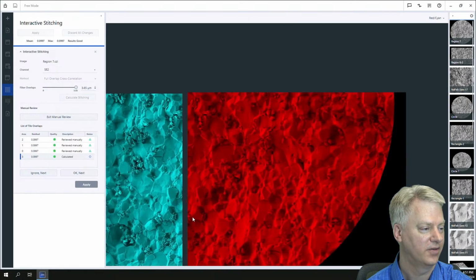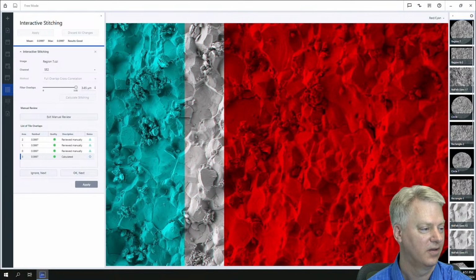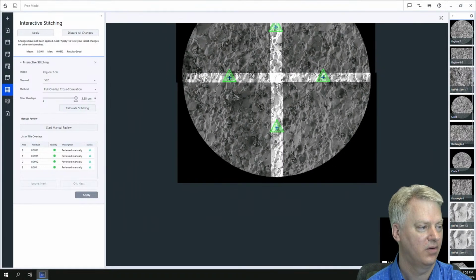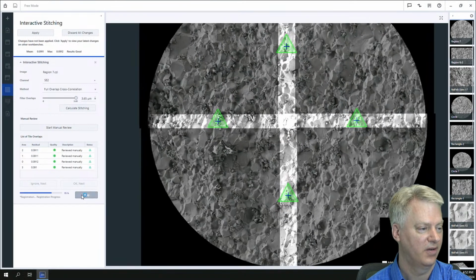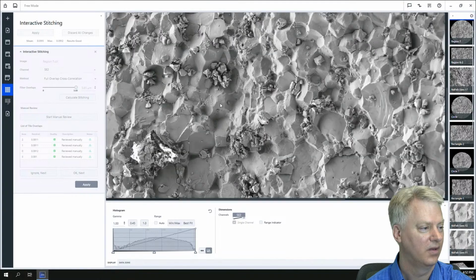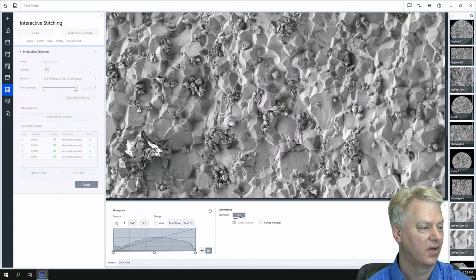I'm going to zoom in. It's down in this area here. Get these 2 on top of each other and tell it to snap to that. All right, I said apply them all. It's indicating they're green, and it looks good. I'm just zooming in and out using the scroll wheel. Let's move on to checking it out. This is what it looks like back in the image itself. Looks good. You don't see any of the stitching artifacts.